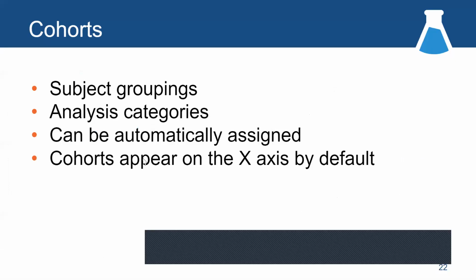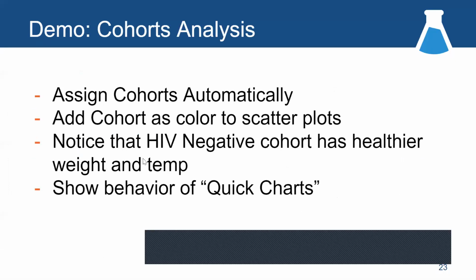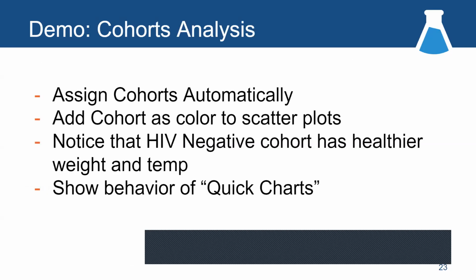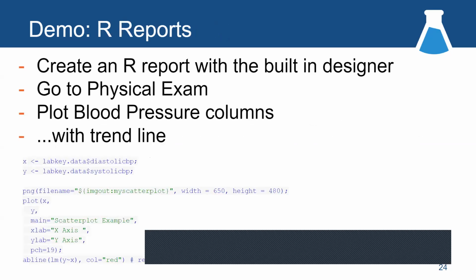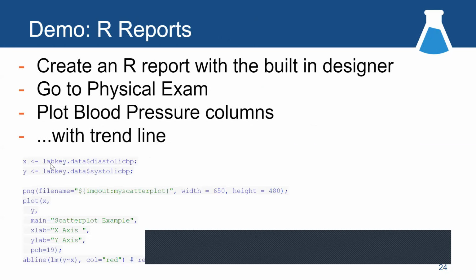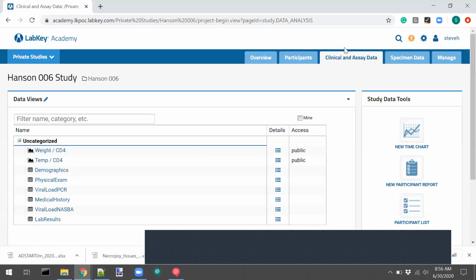Let's keep going. I'm gonna skip some of these. I did notice that in our group, there's a fair amount of data scientists that are here. And I thought we could do an R report.